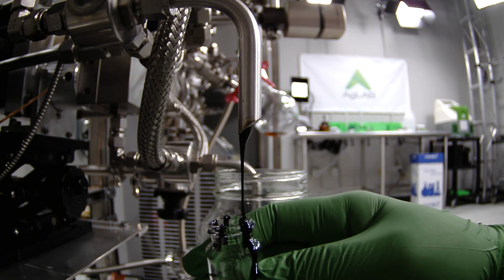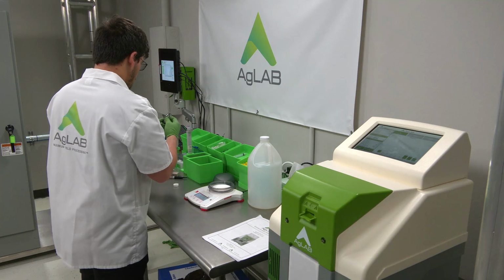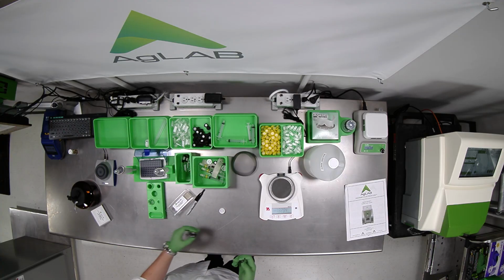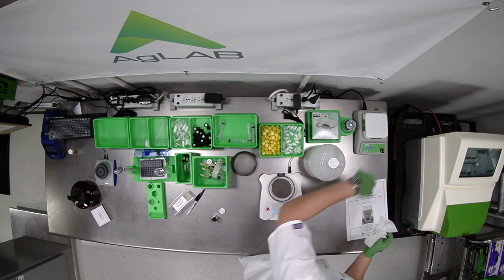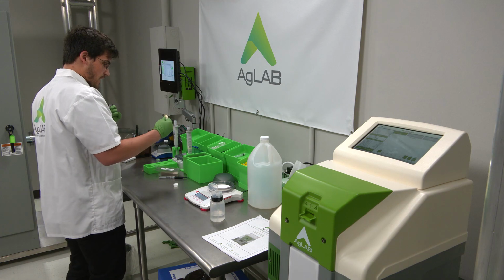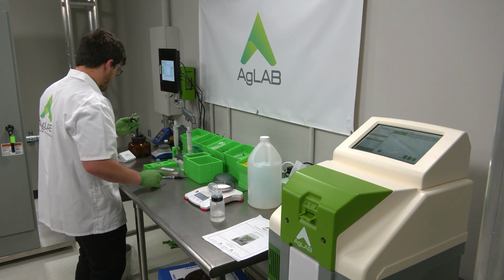Oh my goodness, I'm just everywhere. All right, that's okay. And again, it's not super important to know the exact weight for this step, as we're not doing anything directly with this material. We're going to be doing a transfer to our D1 vial, but let me go ahead and try to get this cleaned up a bit. Okay, material on your neck or on the outside of the glass, it's not desirable, it's messy, but for this weight collection vial that just contains a sample, again, it's not a big deal if we don't know the exact weight in here.